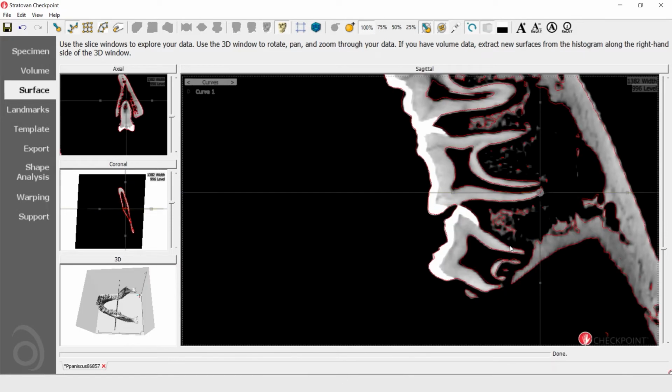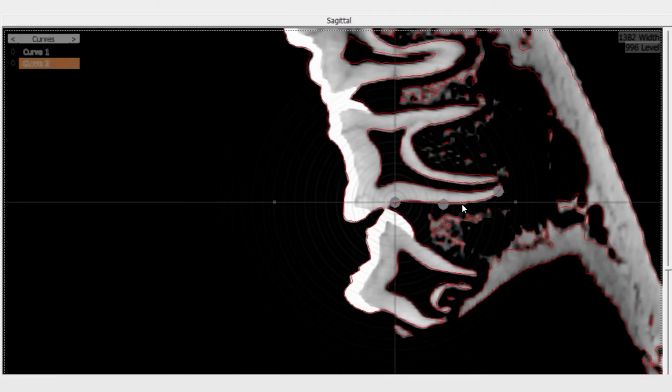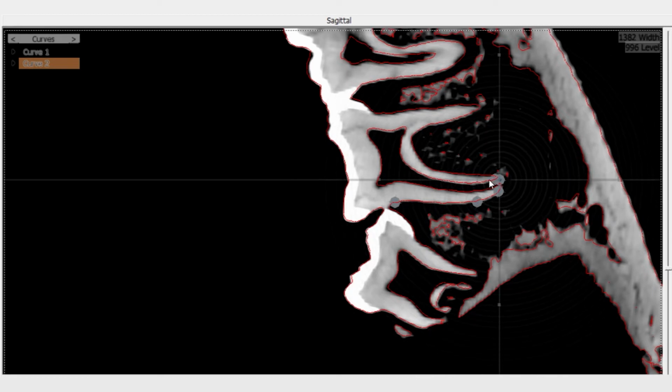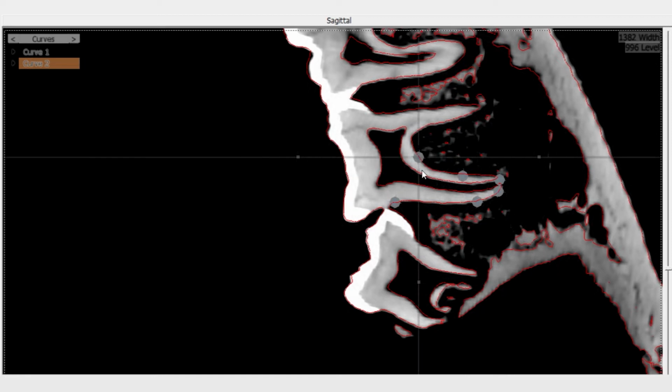So again, we're going to collect 5 landmarks. Hold down the Shift button, collect 1, 2. Now we can't click on a landmark exactly at that point. We got to do one slightly to the side of it. 4, and 5. So what we're going to do then is merge these 2 points. So you just have one point defining the tip of the root for both curves.